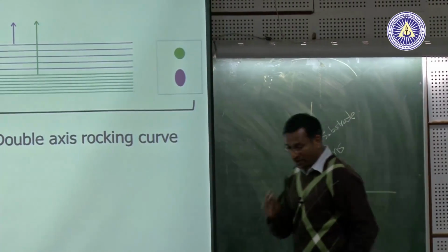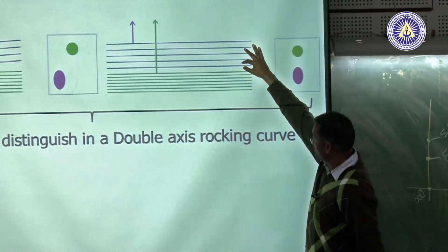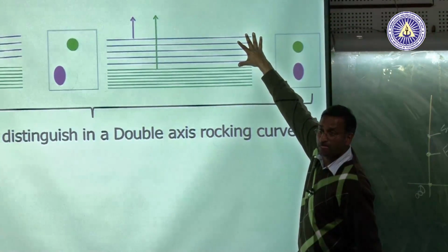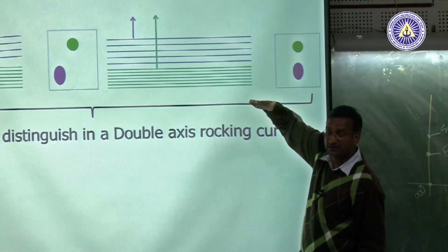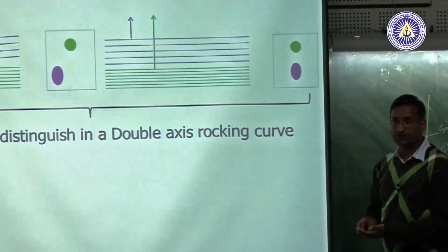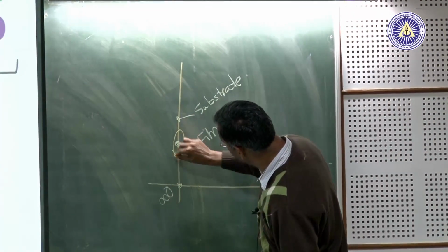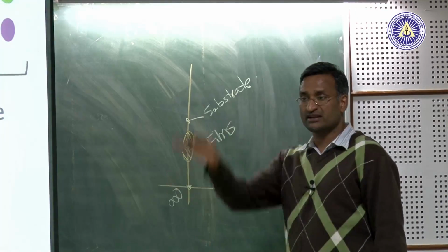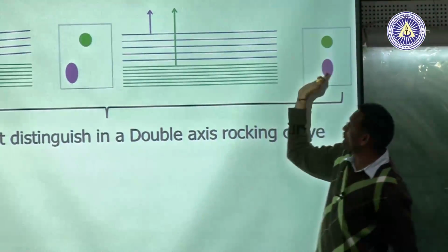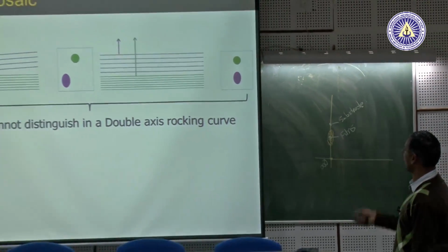Now imagine a situation, if your thin film has variation in the d spacing along this direction, what do you expect? You will have variations in the d. Variations in the d will give you elongation of this spot. So, what you see in the data is the elongation of these particular multiple g values occurring around the spot in a particular direction. So, this will give you elongation. If you have variation in the d spacing, you will get a variation in the length of this spot.